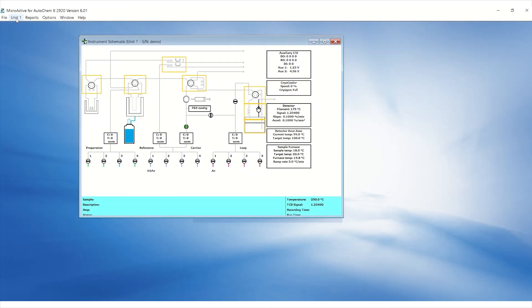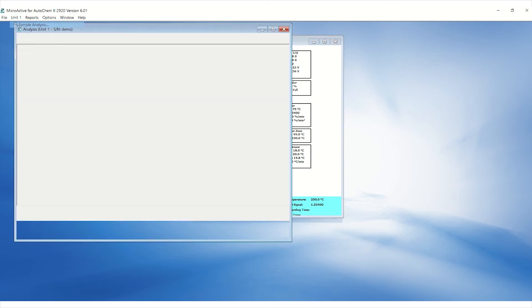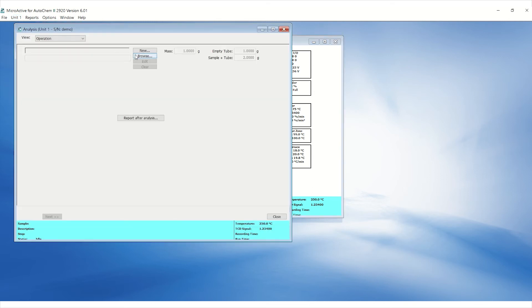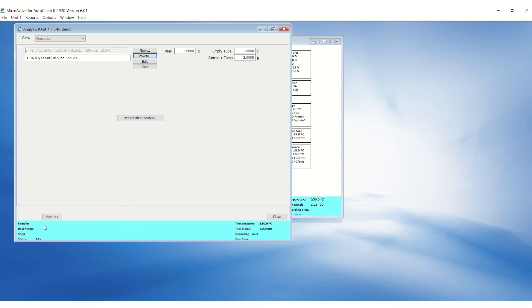To start the calibration, go to the unit menu, sample analysis, and select the SMP file, and then click Next and Start.